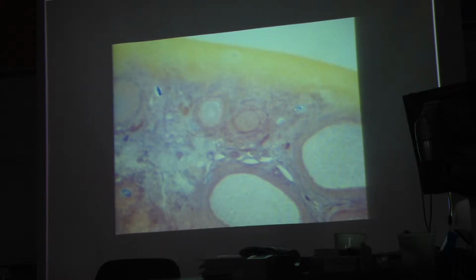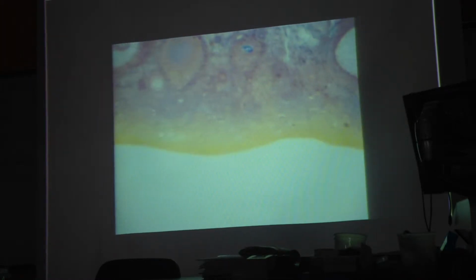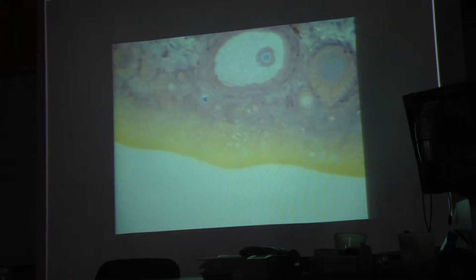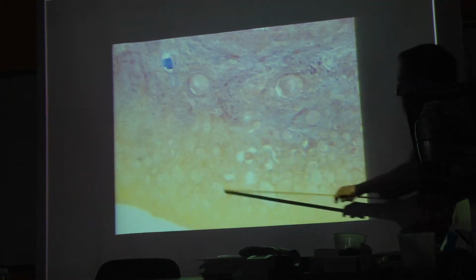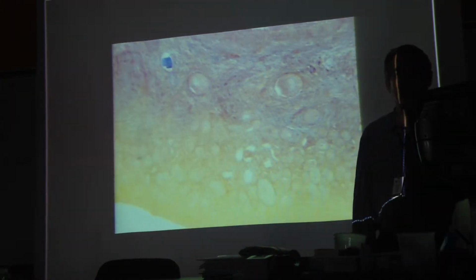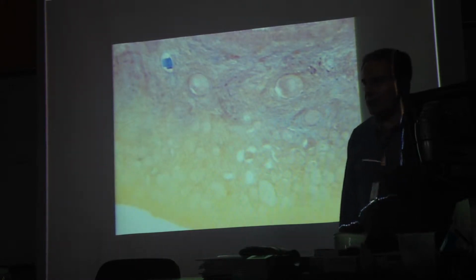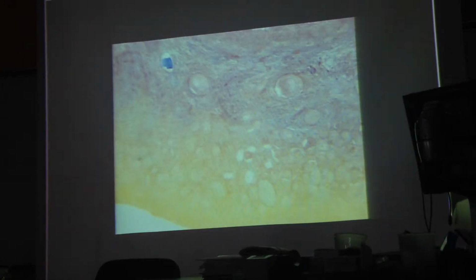You should also be able to recognize the follicles. Three distinctive follicles. The most numerous, the most immature, and usually toward the outside of the cortex, are called what? What kind of follicles are these? Primordial follicles. As I said, a female is usually born with all the primordial follicles she'll ever have, usually hundreds of thousands in human females. And before she goes through puberty and becomes sexually mature, a lot of them have degenerated already.